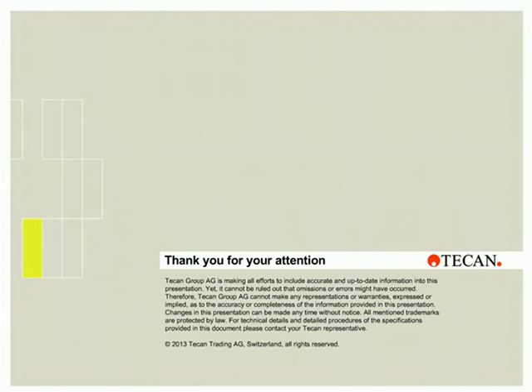That's great, thank you. So the next question we've got here is, how can you be sure to measure the best signal in a 3D microsphere?